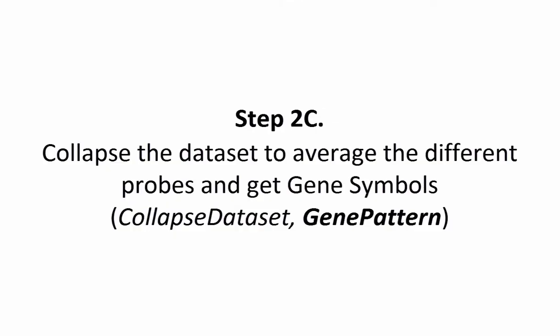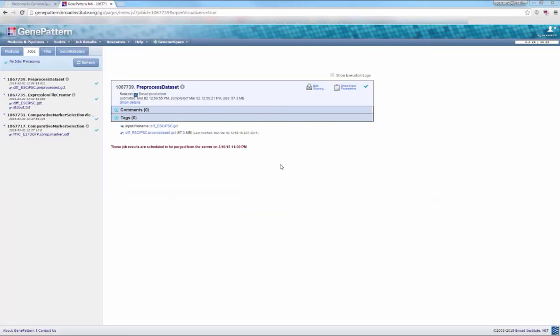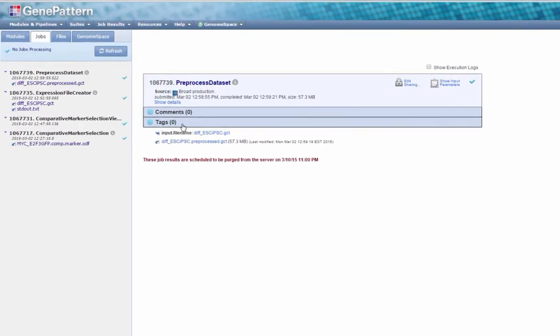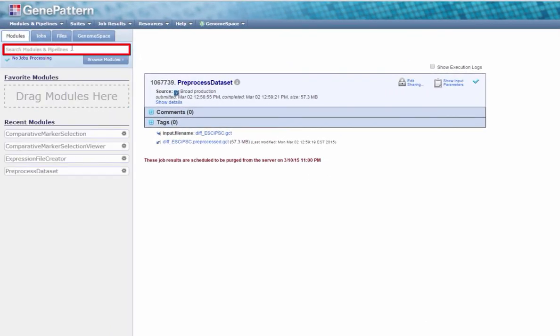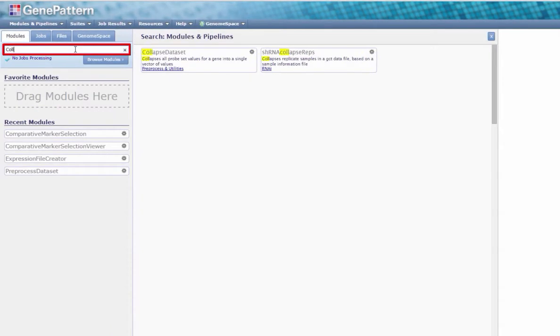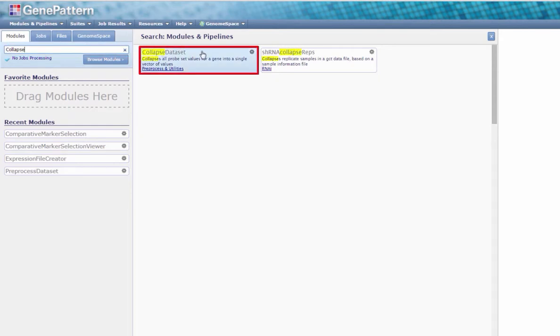Step 2c. Collapse the dataset to average the different probes and get gene symbols using GenePattern's Collapse Dataset module. Again, head to the Modules tab to search or browse for the module Collapse Dataset and select it from the slide-out menu.